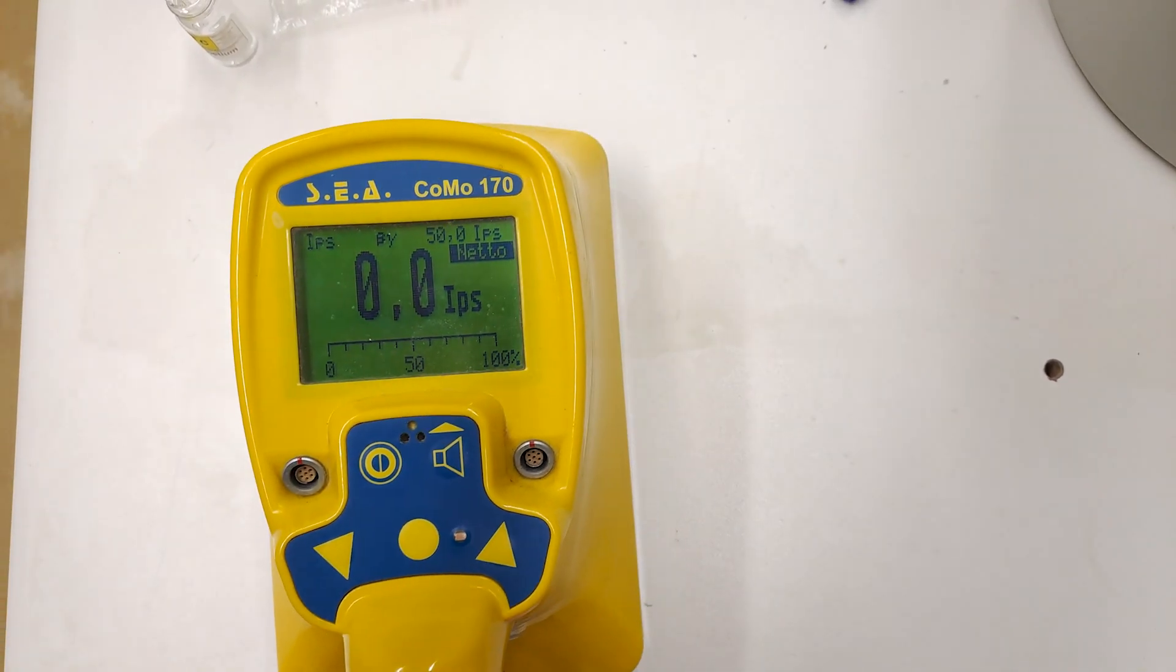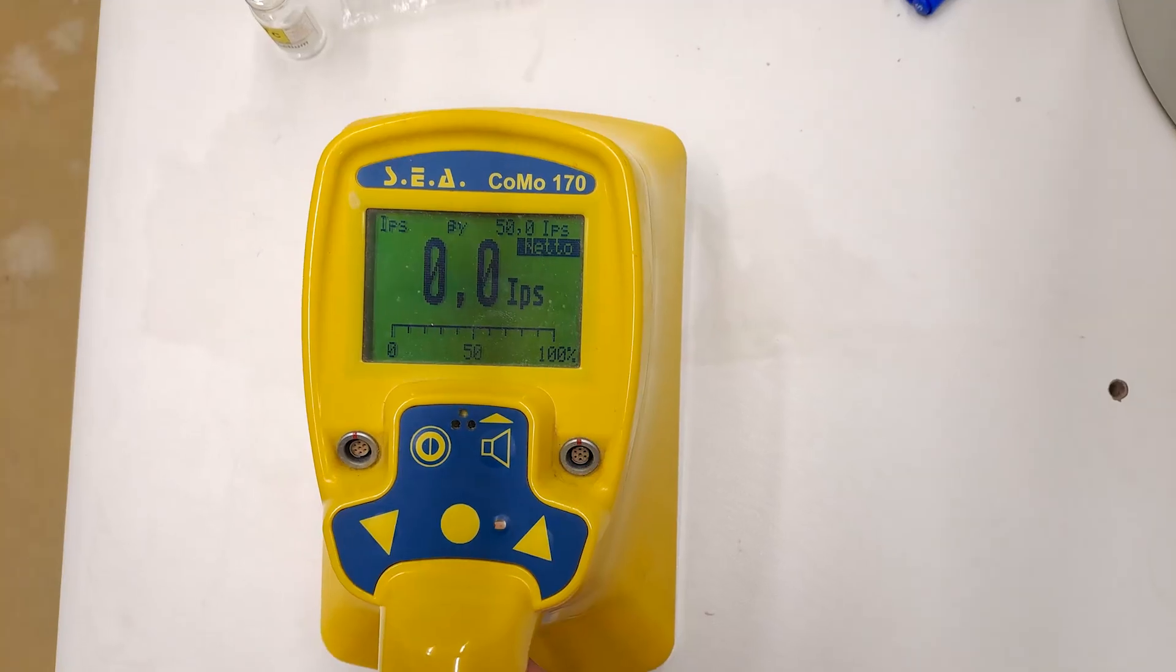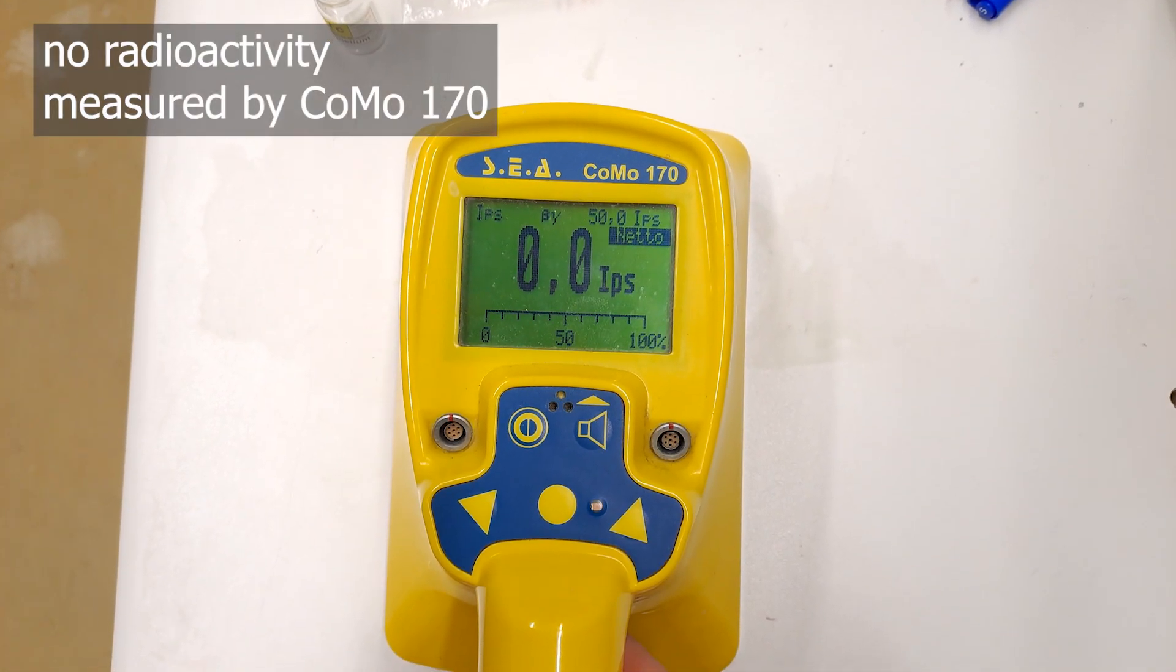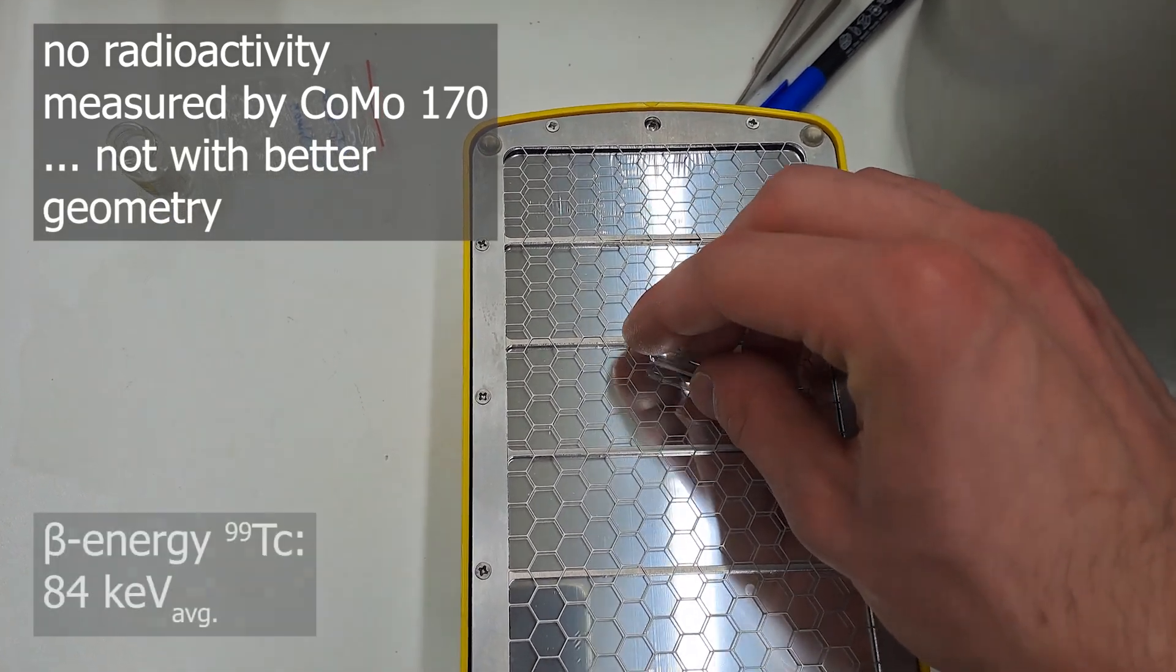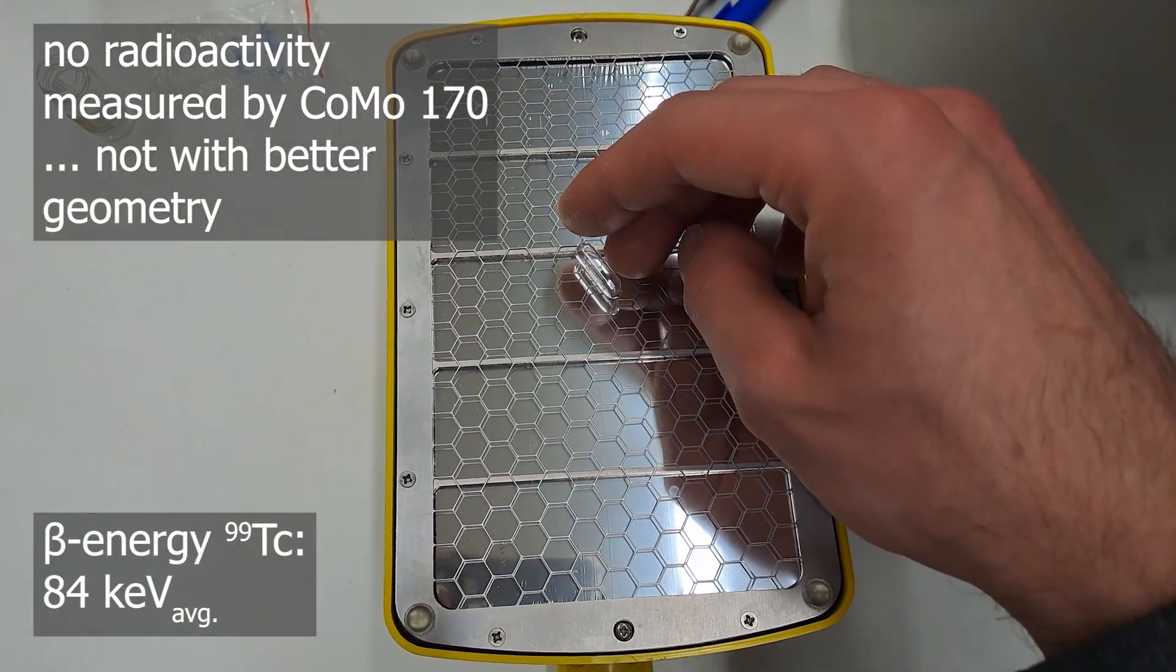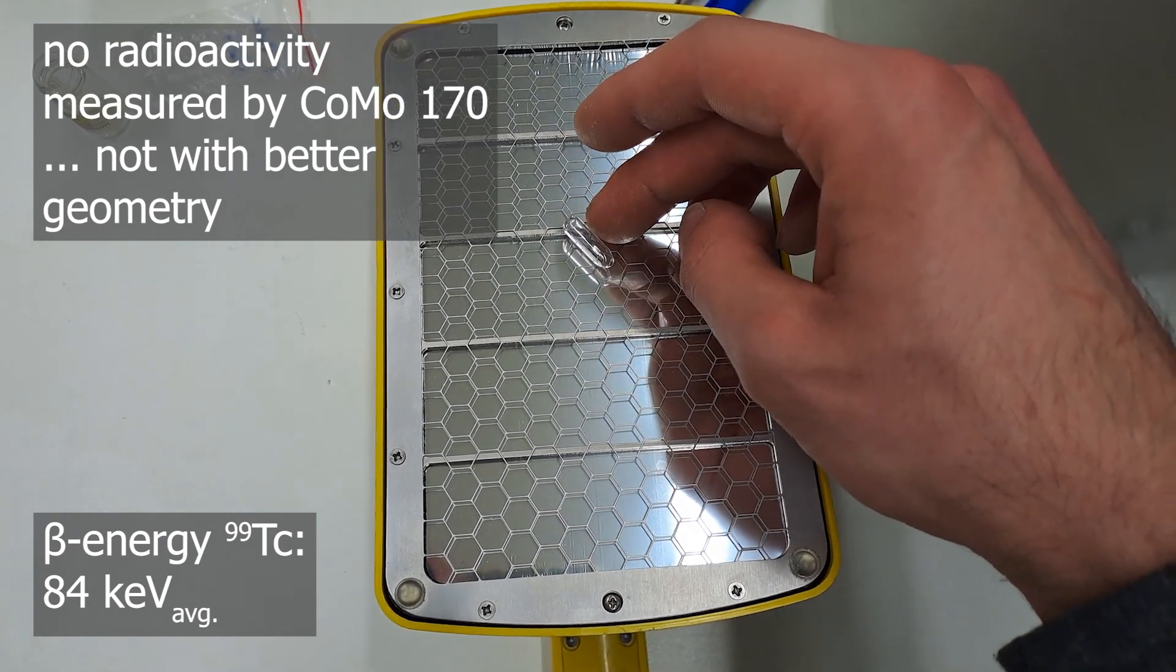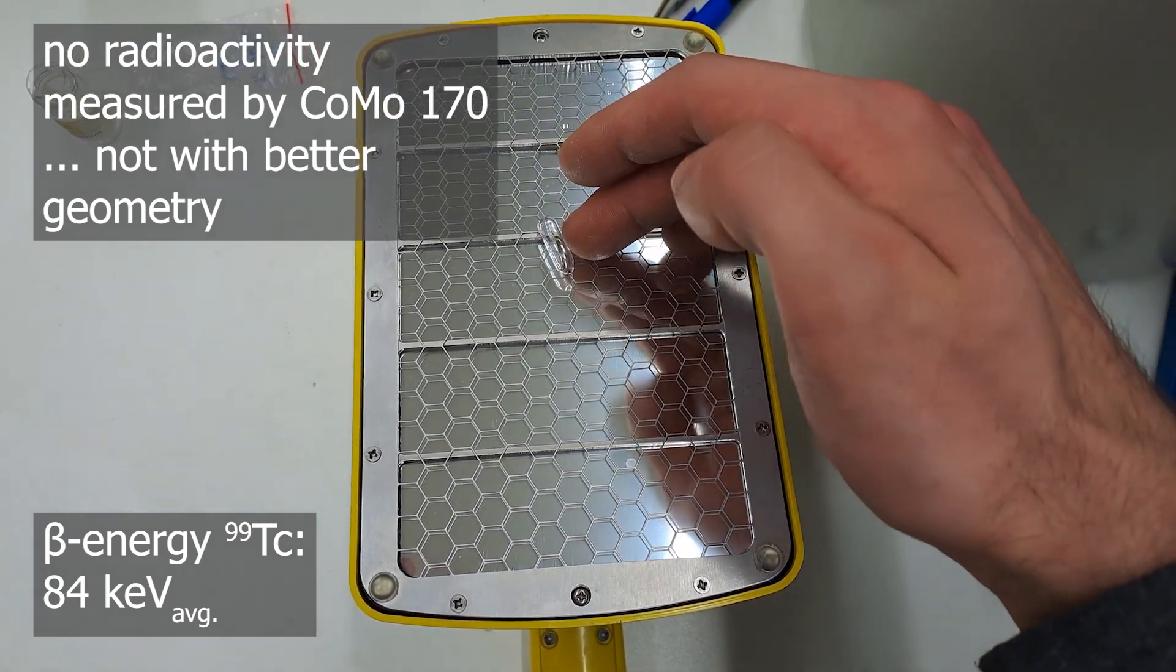Okay, technetium is radioactive, so let's test it with the COMO-170. And through the glass vial, absolutely nothing comes through. This shouldn't be surprising either, because the beta energy of technetium is only about 84 kiloelectronvolts on average. No matter how much you have, it would be easily shielded by the glass. Okay, so now we are not talking about megabecquerel's amount.